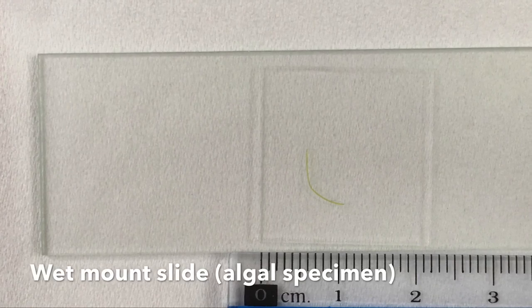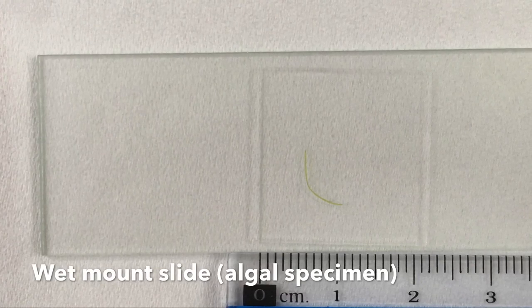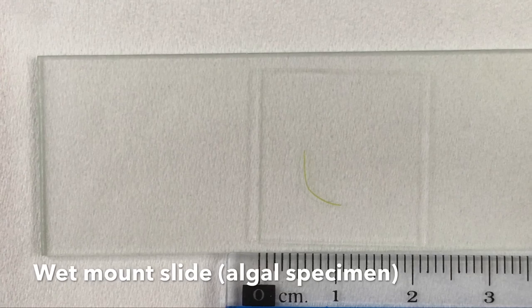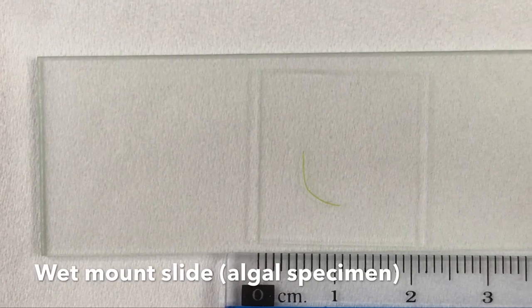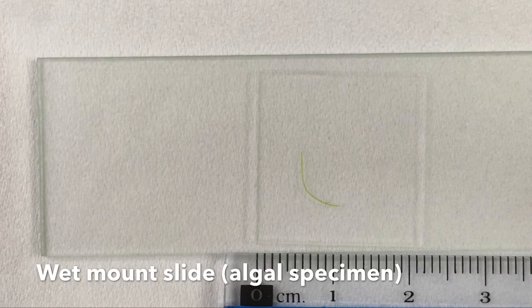For our online lab, we have made a wet mount slide of a piece of algae for you. Please draw this specimen in your lab report.